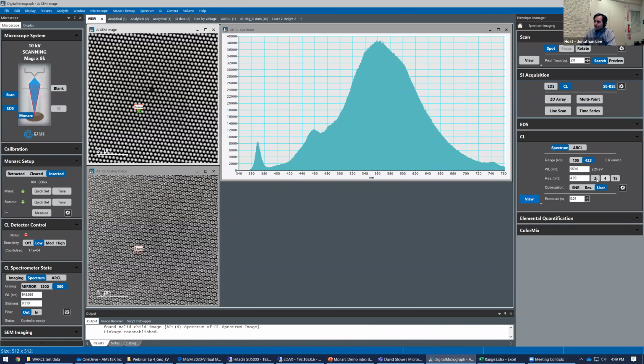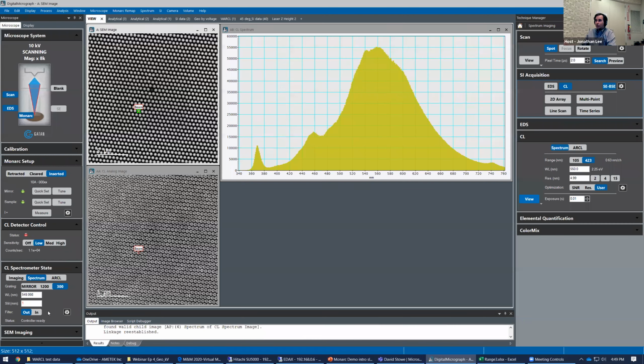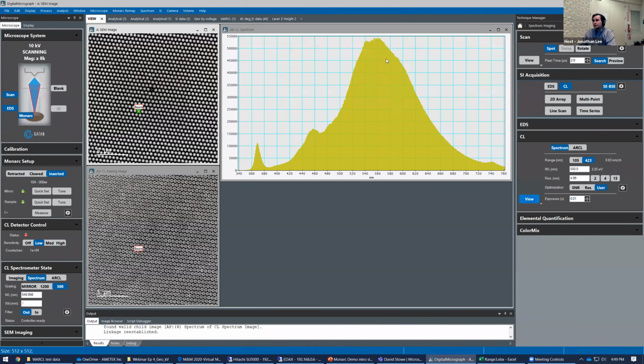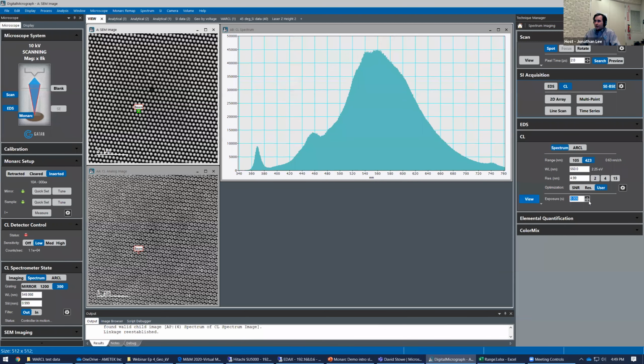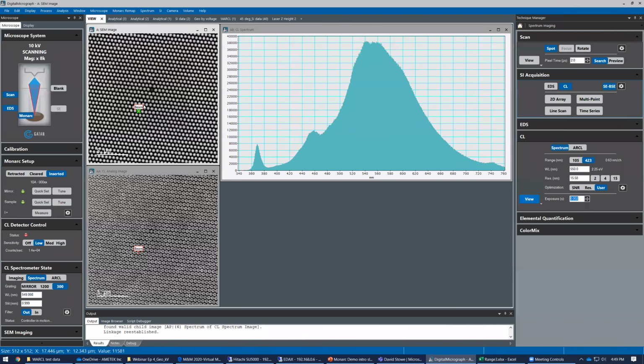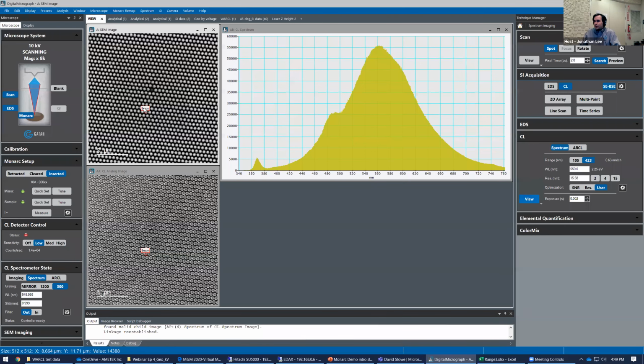So we have a few easy settings over here, or you could type in freely, or you can put in a slit size as you like. Just as an example, I'll go to a very large slit, so 1 millimeter. Immediately you see the amount of light that's coupling back into the sensor is increased dramatically because now we're near saturation of the sensor. That's what this yellow is telling us. So I can reduce the exposure time in order to avoid that. But you don't really get a lot of the fine featured spectral information here. You just see lines.